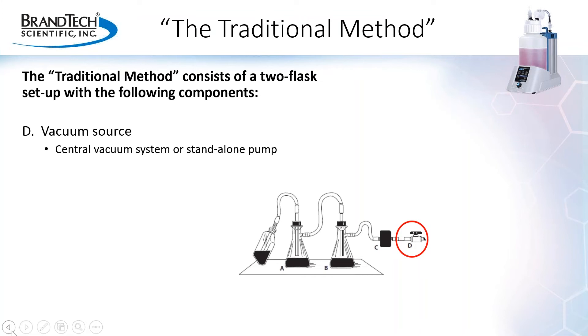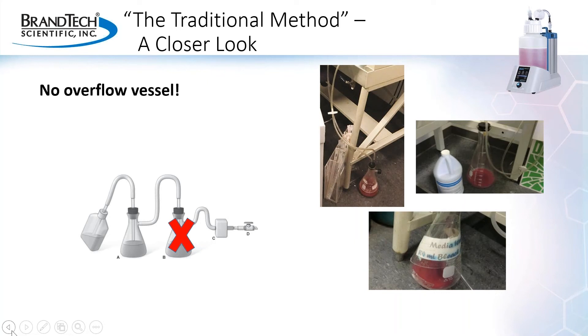So how well does this two-flask setup address safety and environmental concerns in the lab? It depends a lot on how well it is actually implemented, and implementation can vary greatly from lab to lab. One of the critical safety considerations in fluid aspiration is containment of the aspirated liquid. As demonstrated in these photos, in many lab setups the overflow vessel is missing. With no overflow vessel, if the suction flask is overfilled, the excess liquid may contaminate the vacuum source or spill out into the lab environment. Additionally, if the flasks are not contained, there is the risk of the flasks tipping over or being knocked and breaking, again spilling contents into the lab environment.